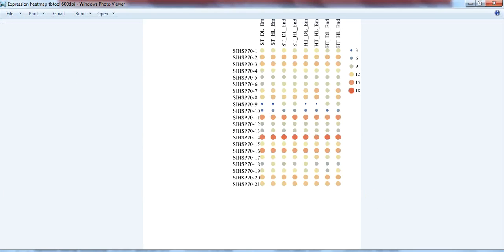This is our video on how to prepare the heat map through TBtools. Hopefully you will get help from it. Thank you.